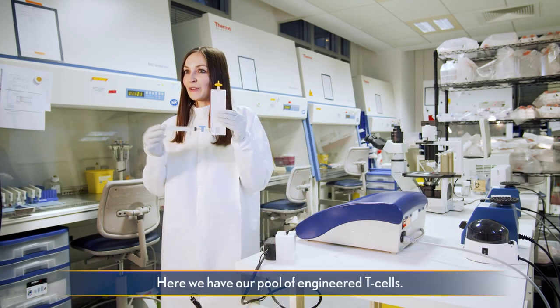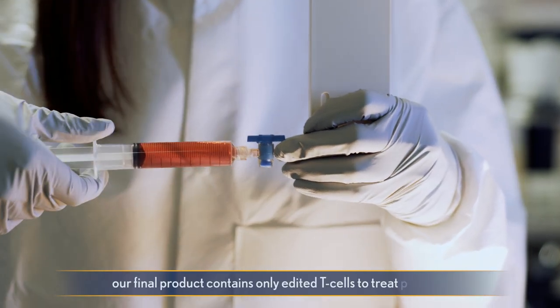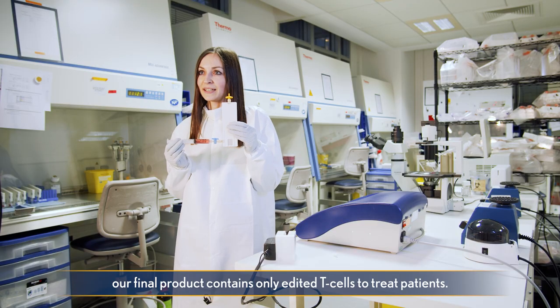Here we have our pool of engineered T-cells. We will filter it in order to make sure that our final product contains only edited T-cells to treat patients.